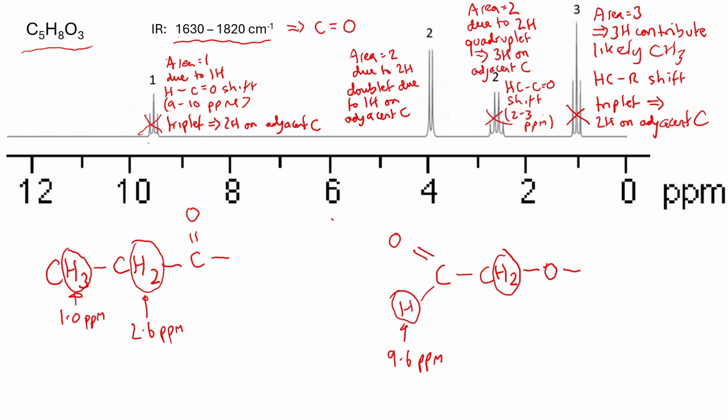So we can say that we have an HCO shift, which is 3 to 4.3 ppm.